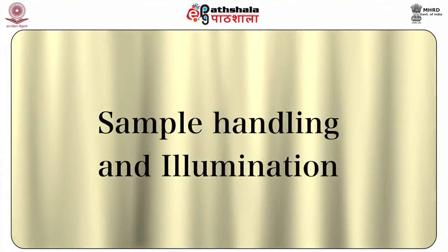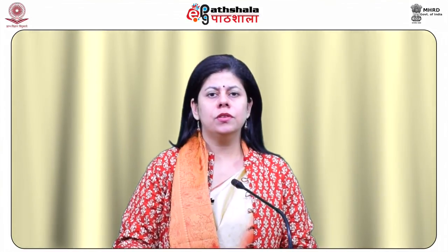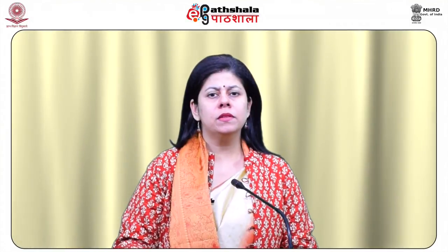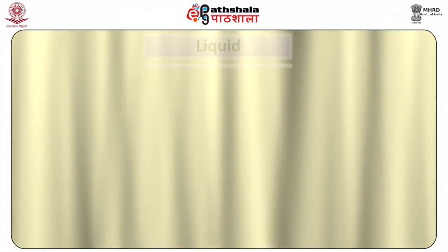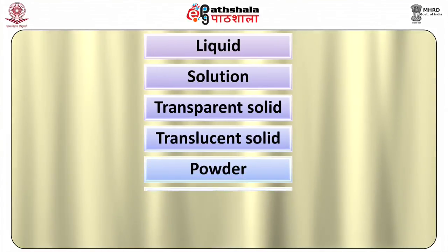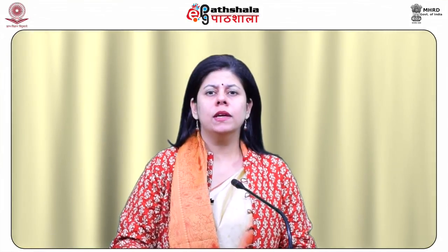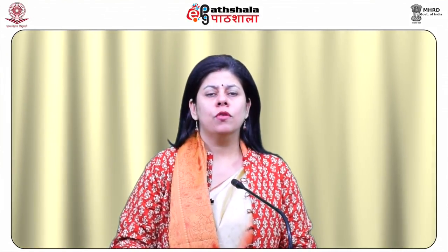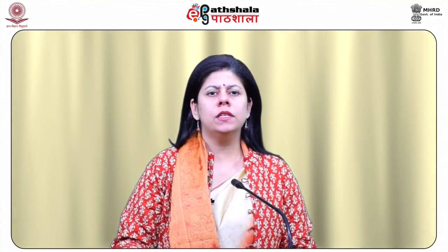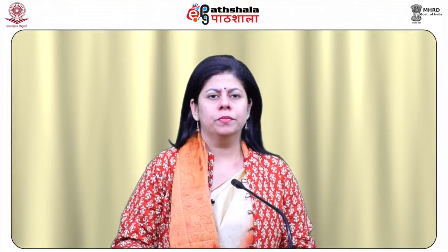Sample handling and illumination. The use of laser excitation allows Raman spectroscopy to be performed on specimens in almost any state: liquid, solution, transparent solid, translucent solid, powder, pellet or gas. Liquids are usually examined with a single pass of the laser beam, either axially or transverse, to the neat liquid sample contained in a glass capillary tube.